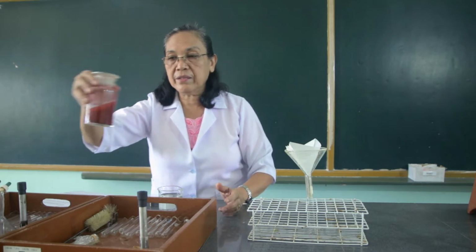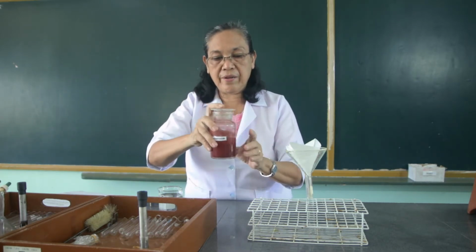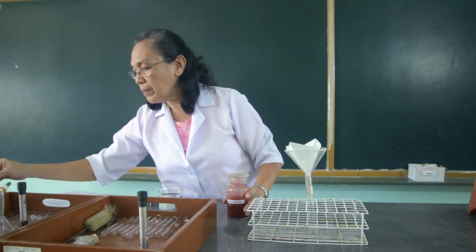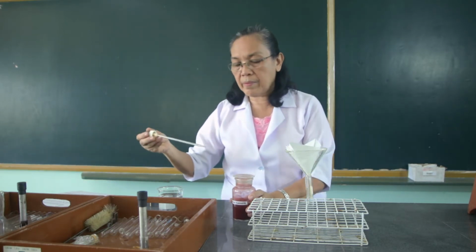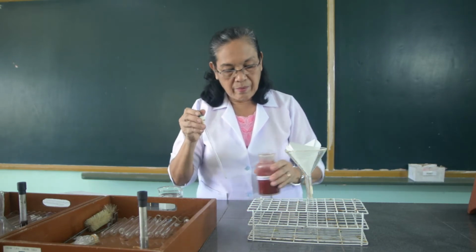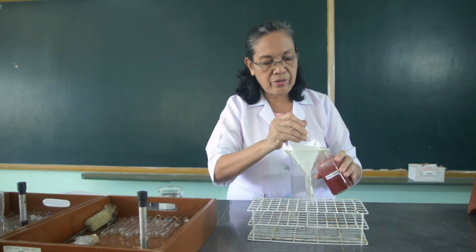And we will filter the ferric hydroxide. Let us just use 2 ml.